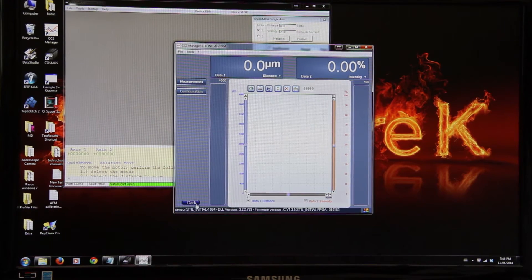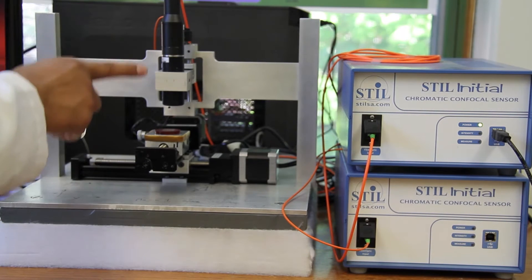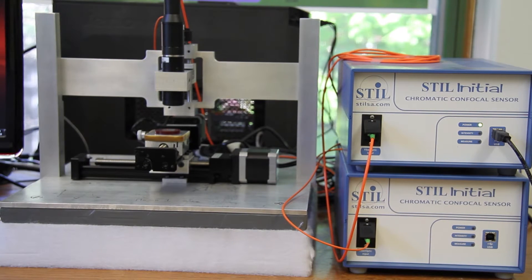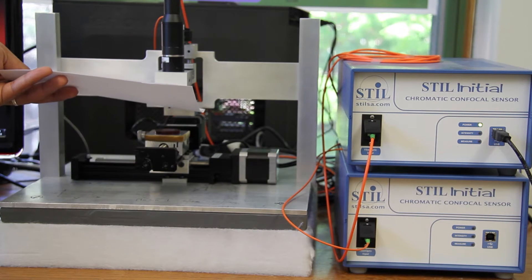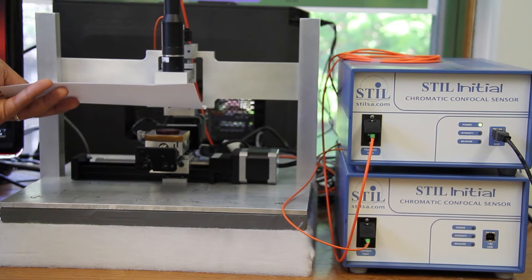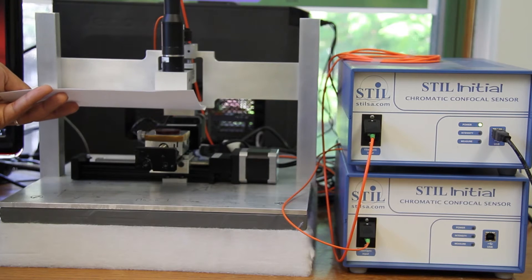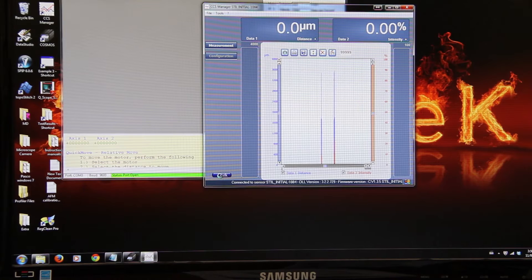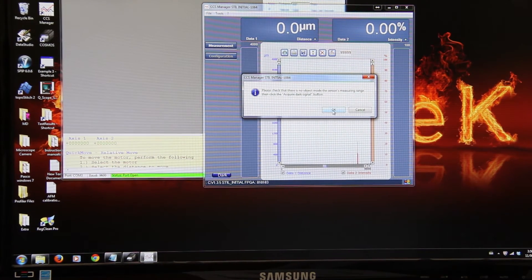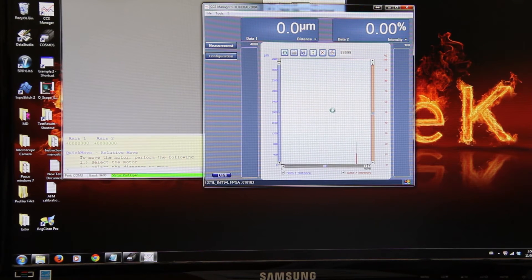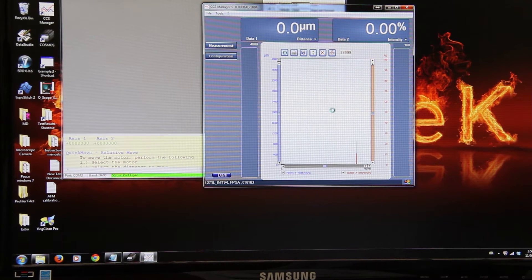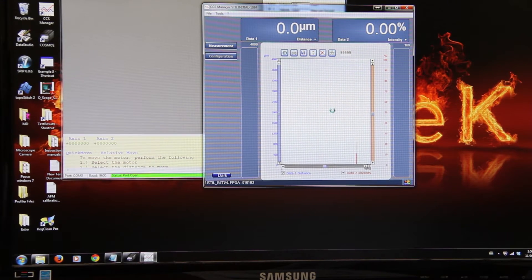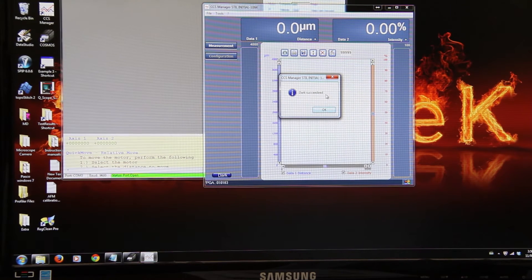We need to perform dark signal acquisition. Today we are going to use this pen. In order to perform the dark signal, blank off the light beam by placing a piece of paper over the tip of the optical pen and click dark from the software in CCS manager. Click the dark signal acquisition button. Press OK. Dark succeeded.